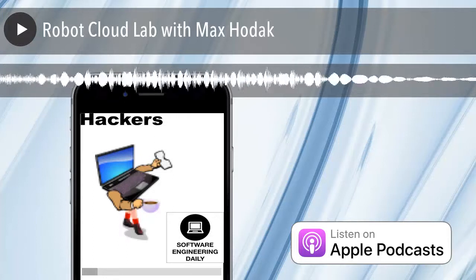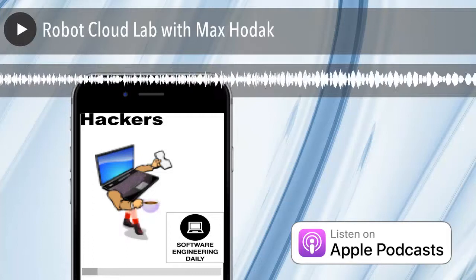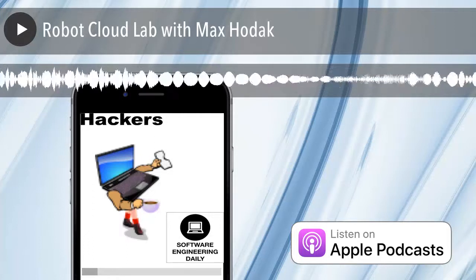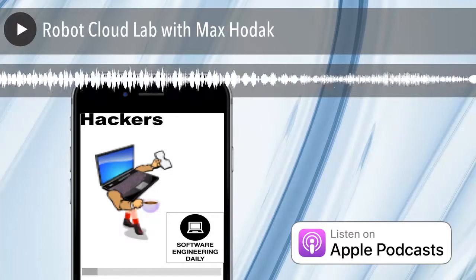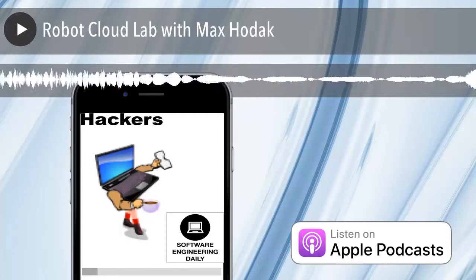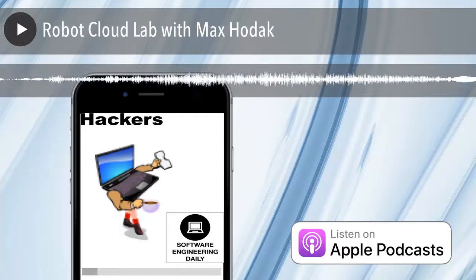Max Hodak is a co-founder of Transcriptic, and he joins the show today to explain how a robotic laboratory works. There are a wide variety of challenges from hardware integration to software reverse engineering. But we also talk about why it is worth it to overcome these challenges, including a discussion of the reproducibility crisis that is undermining the faith of our scientific experiments.